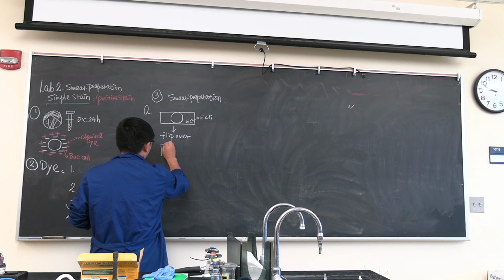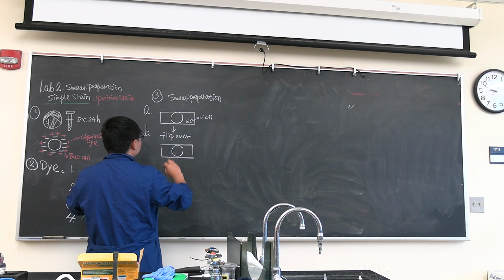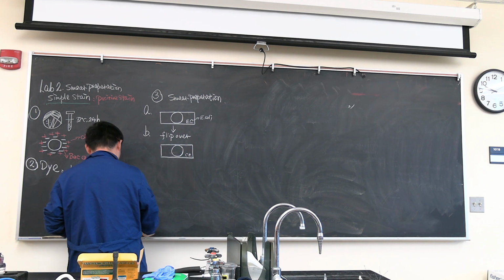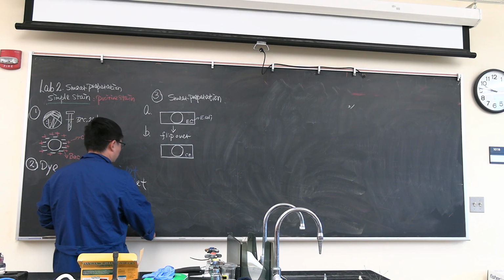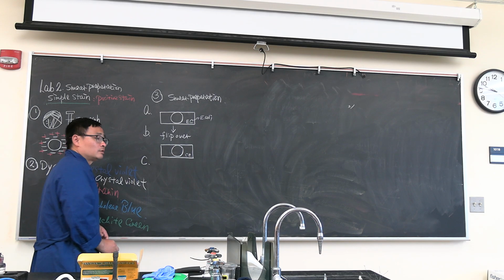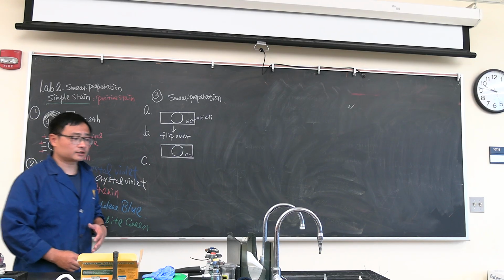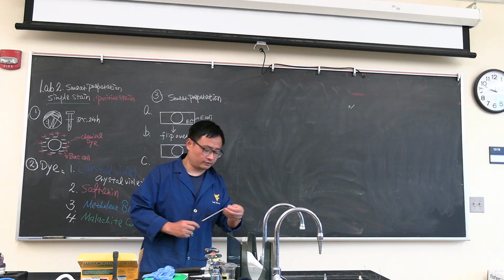Okay, if you flip it over, the EC will look like this. Then we will follow the next step: we will add a drop of water. But before we add a drop of water, the loop has to be sterilized. I'll show you how to do it. Okay, you have a loop like this.